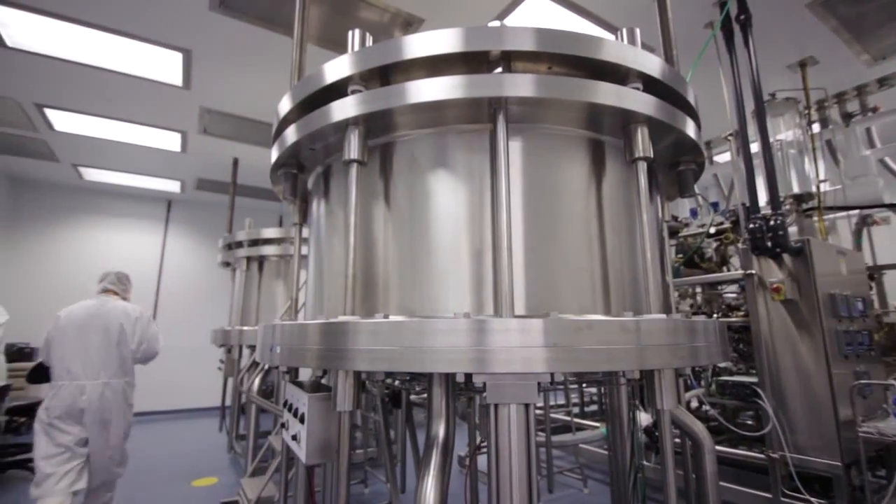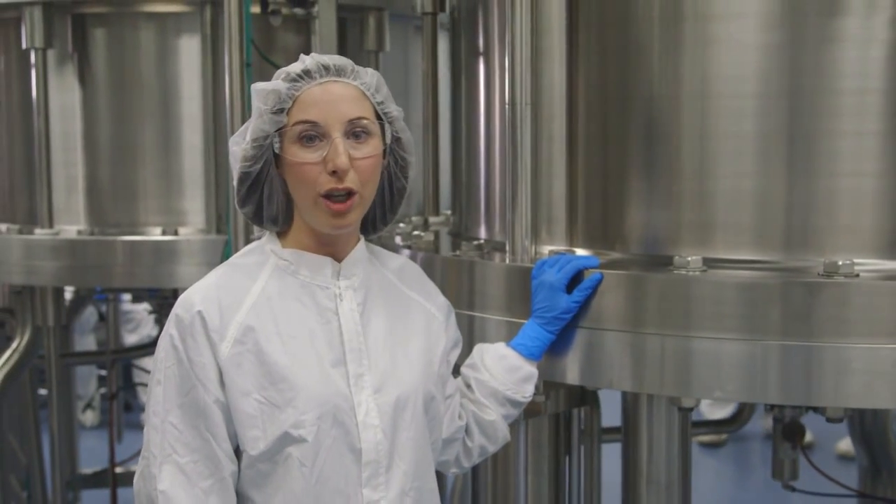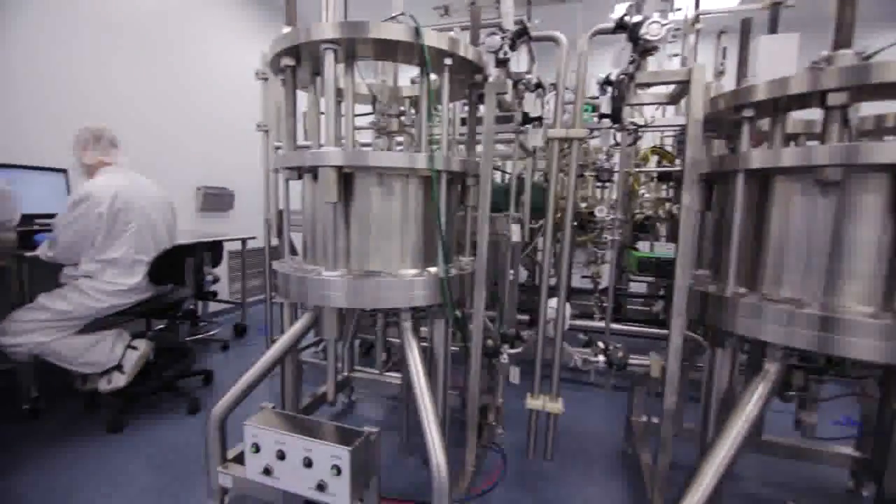This equipment is used to perform liquid chromatography, just one of the many steps that we use to purify the solutions containing our medicines. After that, we collect our protein again to perform our next unit operation.